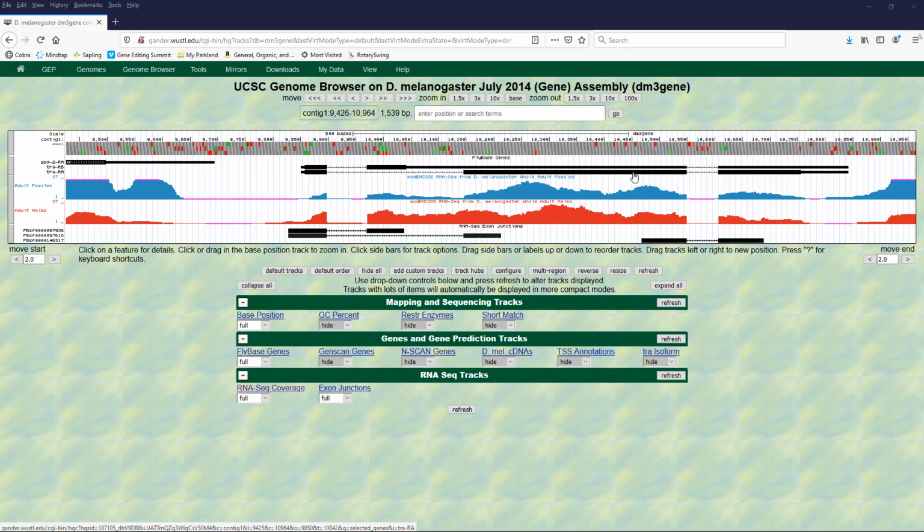Now what we could do at this point is go on and do the same sort of analysis for exon 3, and we could even figure out what the complete amino acid sequence would be for both transformer RB and transformer RA isoforms. But we won't go through that exercise at this point, but of course you're welcome to do that if you like. So we will conclude this lab at this point.